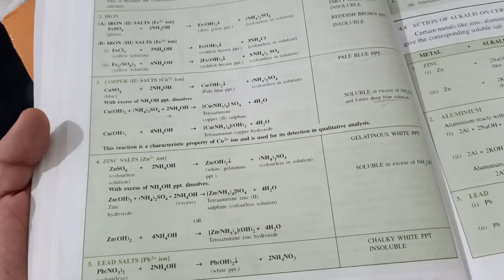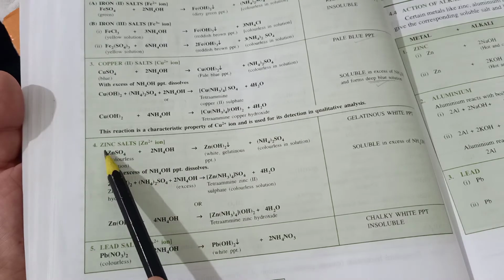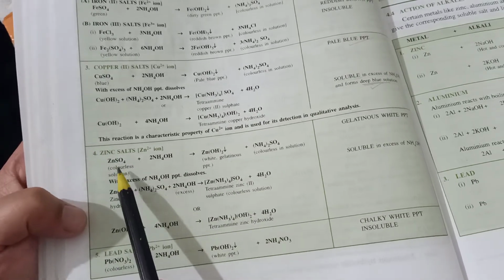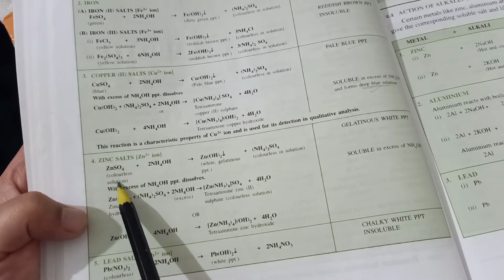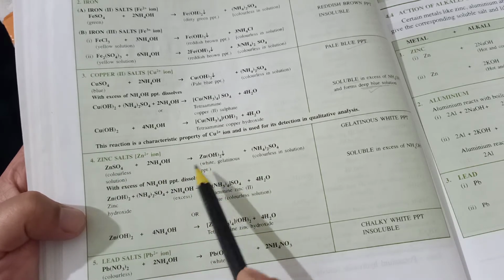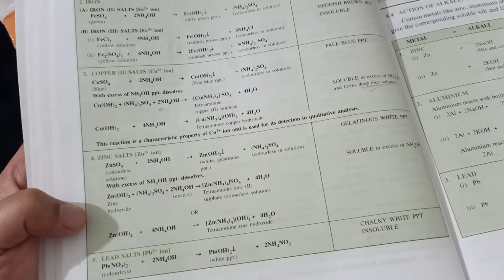Let's go to another reaction, action of ammonium hydroxide on zinc salt. Let's take zinc sulfate. Zinc sulfate is a colorless salt, and its solution will also be colorless. When treated with ammonium hydroxide solution, it forms a white gelatinous precipitate, same as sodium hydroxide.